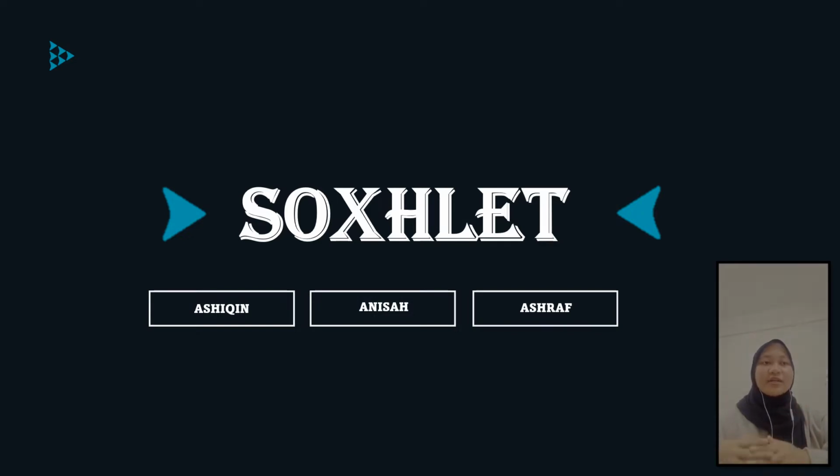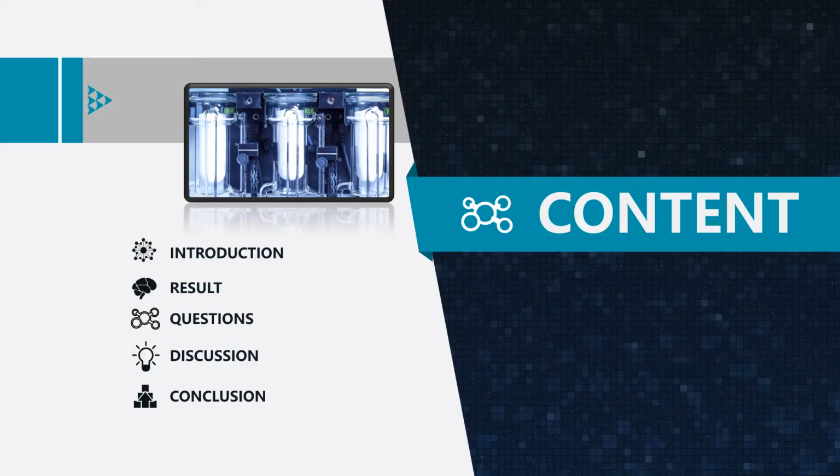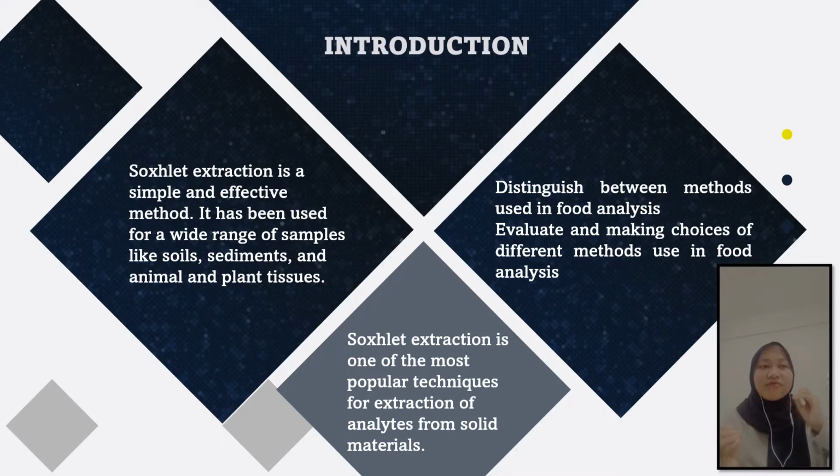So for now, we will present our practical project titled Crude Fat Analysis by Soxhlet. Soxhlet extraction is one of the most popular techniques for the extraction of analytes from solid materials. It is a simple and effective method. It has been used for a wide range of samples like soils, sediments, and animal and plant tissues. Soxhlet extraction is one of the most used methods for the determination of total fat.